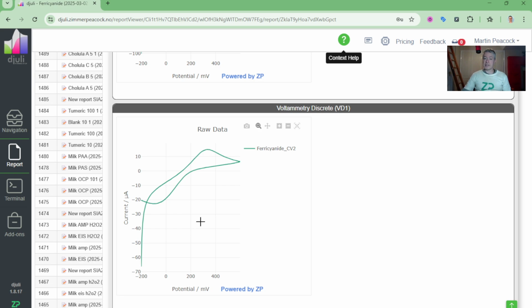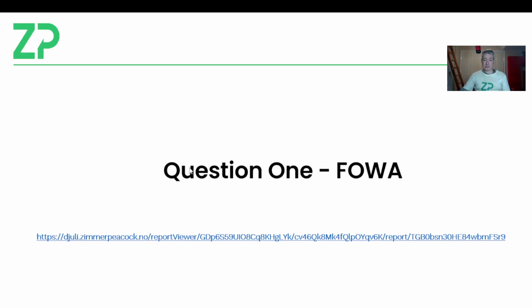The reason I did that was because with cyclovoltammetry, there are 3 regions. You've got the foot of the wave, which this person is particularly interested in. Then you have a mixed region where you've got what we call kinetic control and mass transport limitation. And then you've got a peak in cyclovoltammetry where you become diffusion limited or mass transport limited. This person is interested in understanding and analyzing the foot of their wave, which I have some slides on now. So I'll do some foot of wave analysis here.